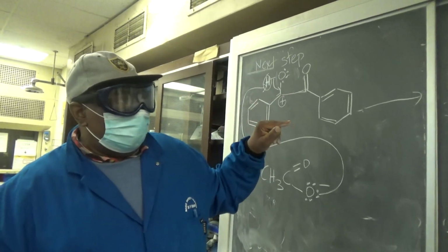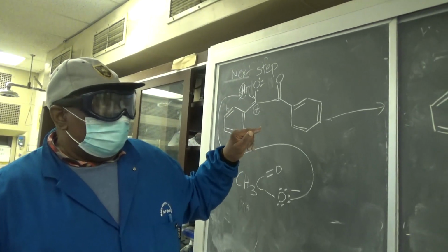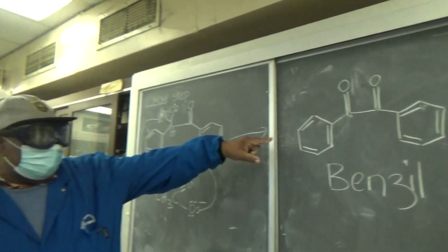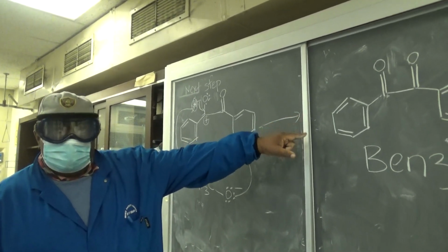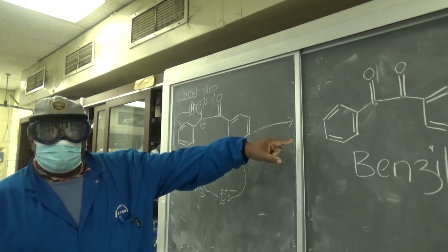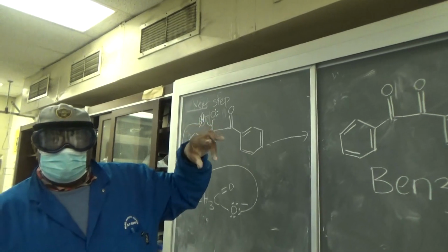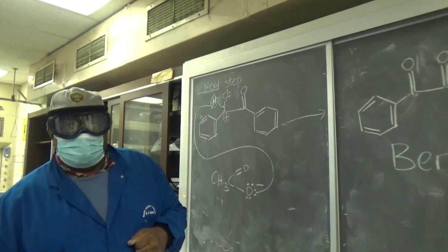You should be aware that it is also possible to synthesize this product, but this time by using nitric acid. So you go from the alcohol and ketone to the diketone. You use nitric acid as reagent. Nitric acid can be an oxidizing agent.